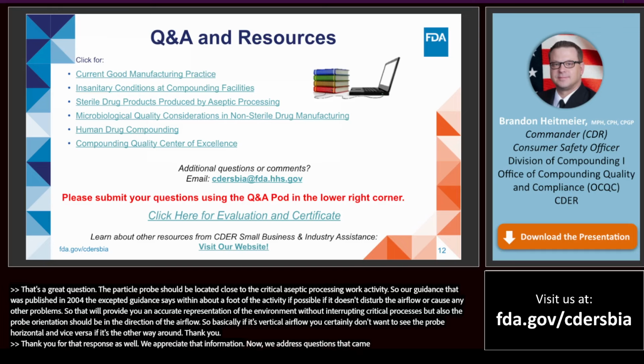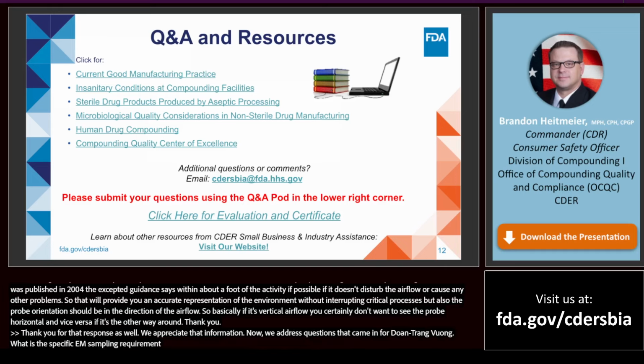Trang, what is the specific EM sampling requirement in an ISO 5 environment during production?